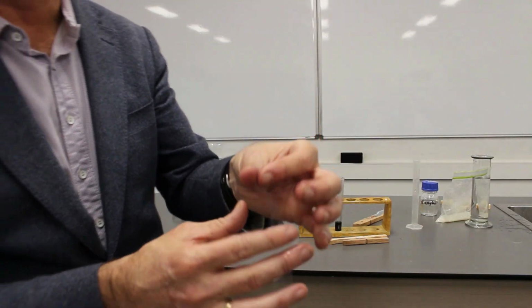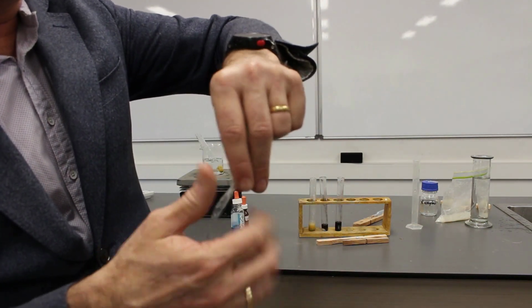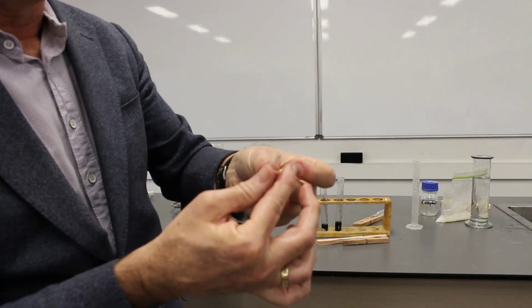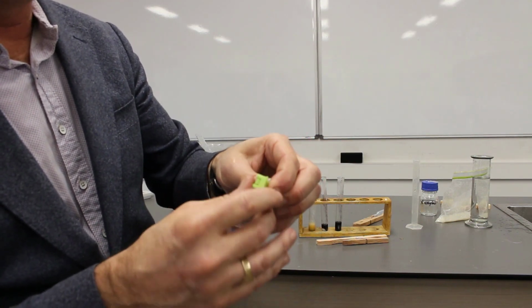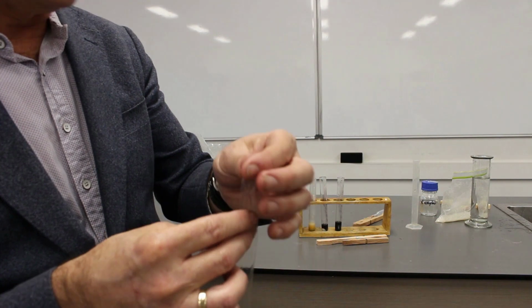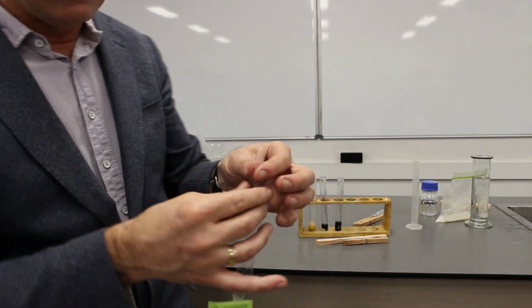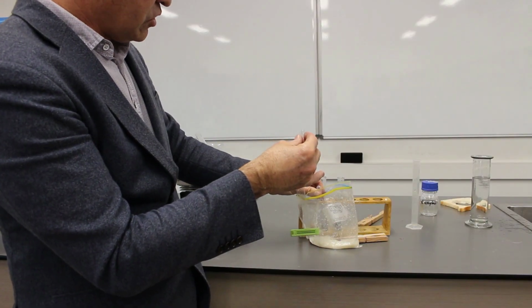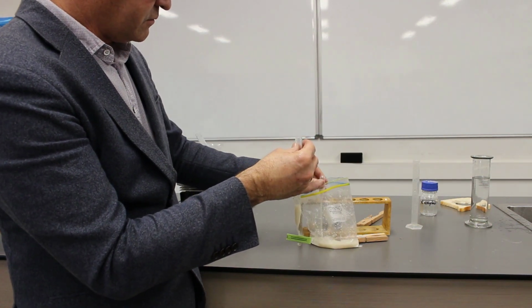Now, what we're going to do is we're going to seal one end with one of these clips. So we'll just give it a twist. We really want to make sure it's a good seal and nothing can sneak out. Give it a twist, fold it over, and then snap it closed. And then on the other side, we're going to use a transfer pipette and then fill this up. So try and fill it up. Alternatively, you could use a funnel and pour it in.